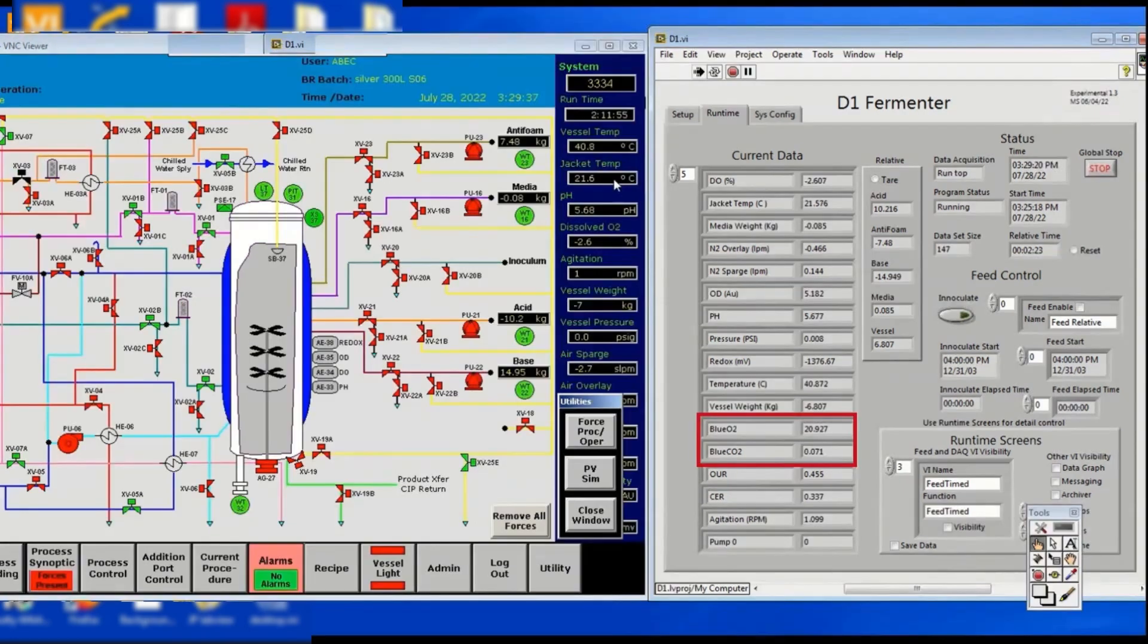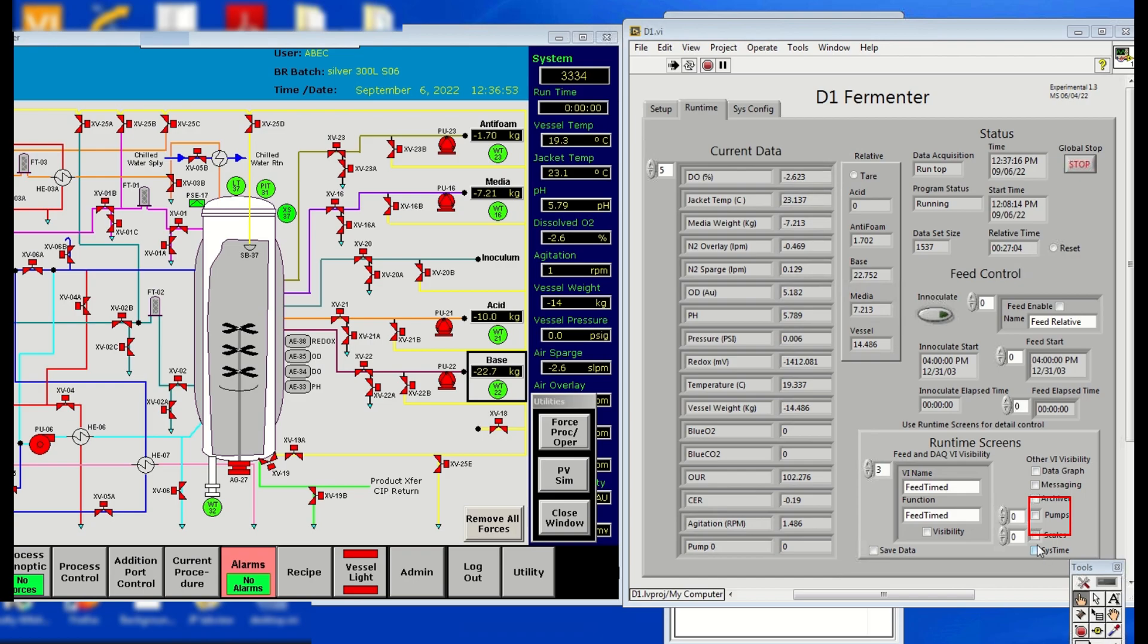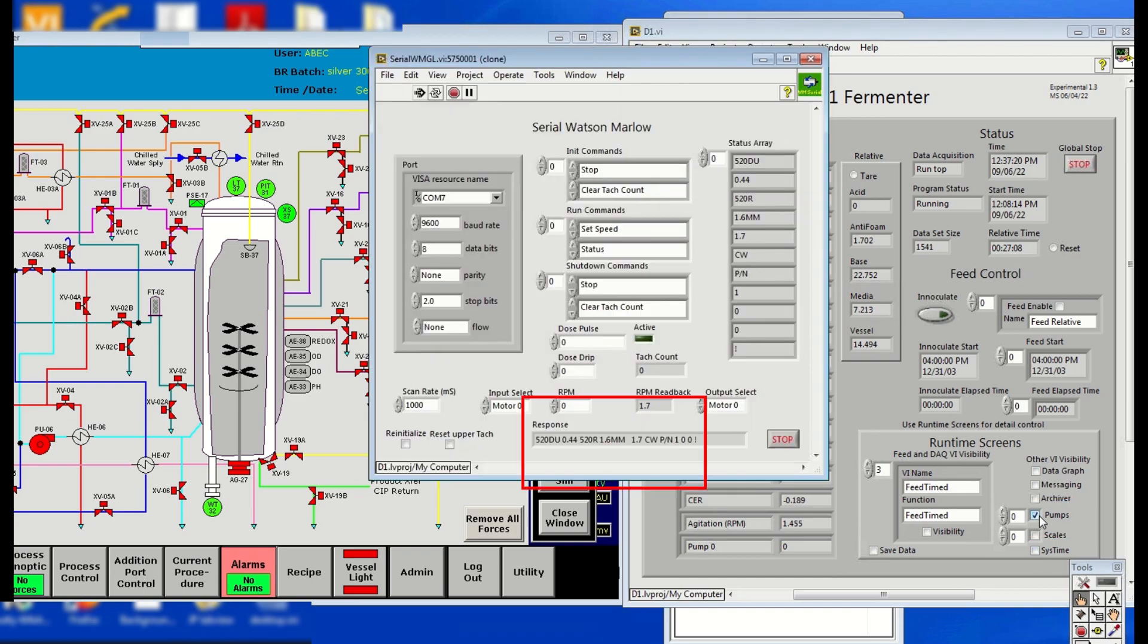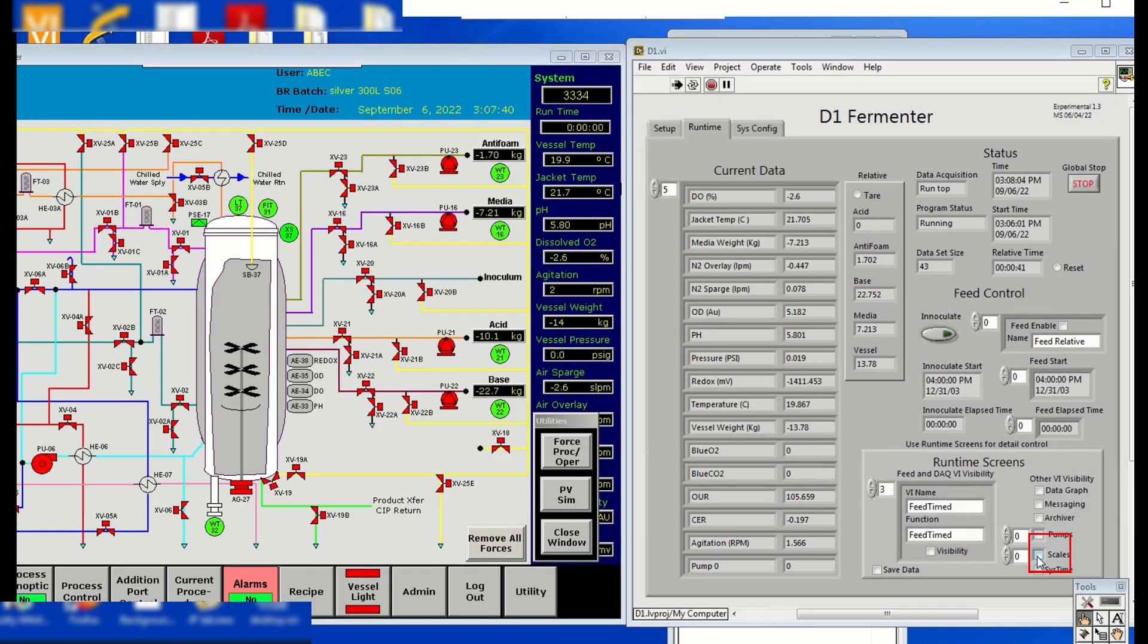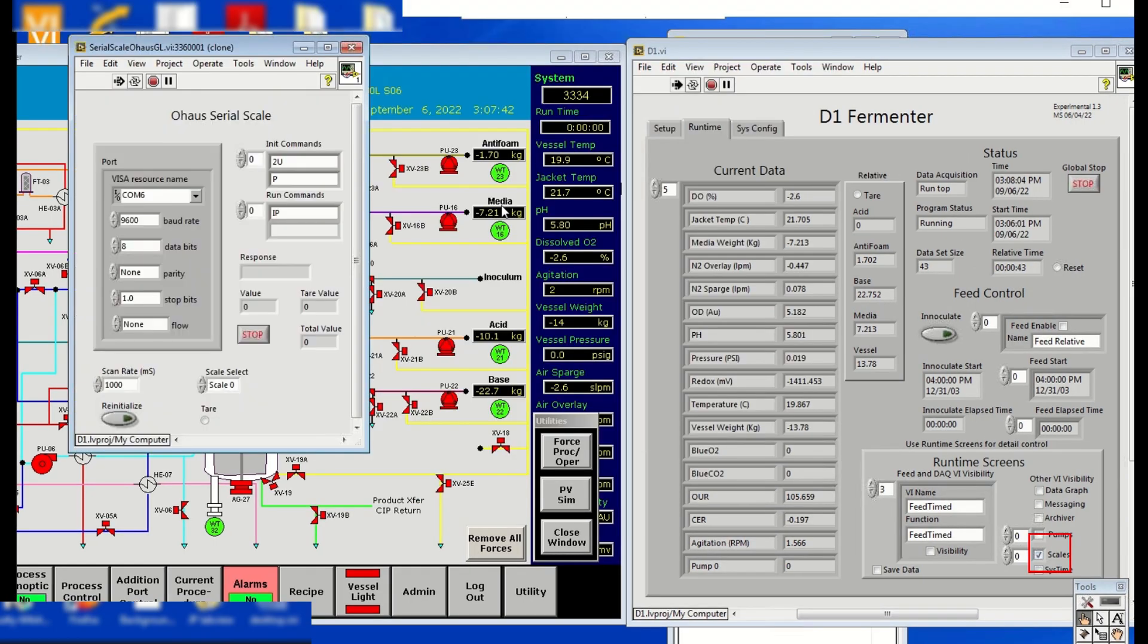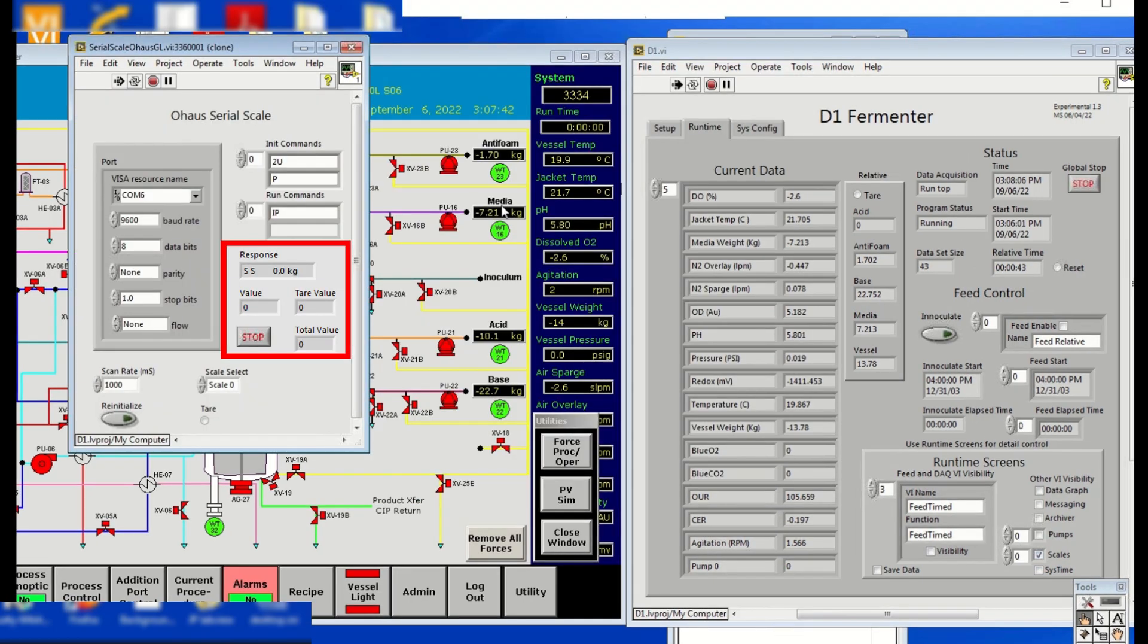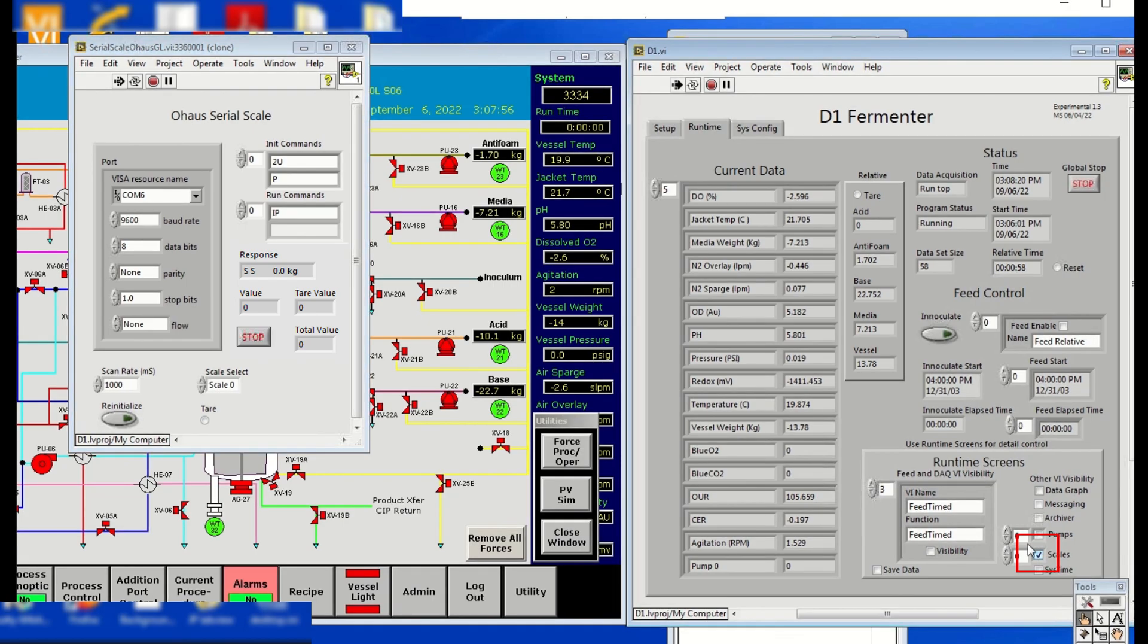Check that the numbers indicated for each parameter match those in the ABEC system itself. Also, the BlueO2 and CO2 parameters should be displaying numerical values in the Runtime menu. Click on Pumps and check that the pump is responding. Uncheck the Pump button to hide the panel. Likewise, check the Scale. The Feed value showing up in the Physical Scale must correspond to the amount shown in LabVIEW. Uncheck the Scale.